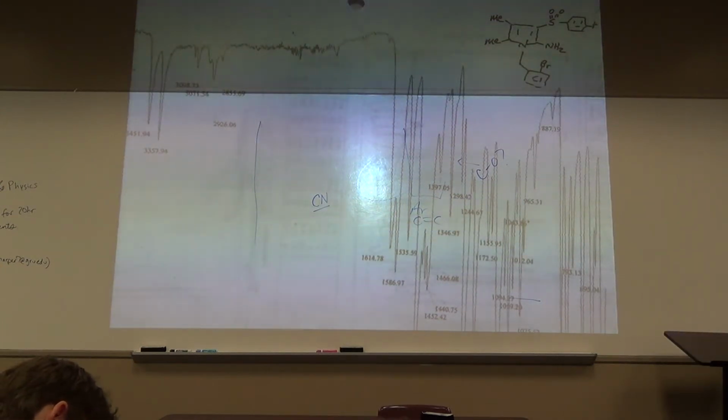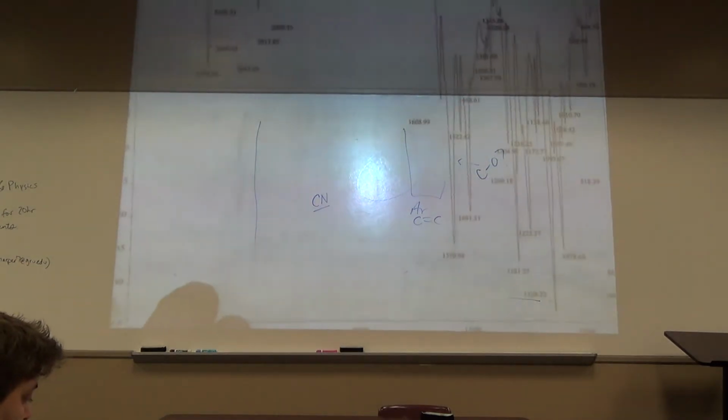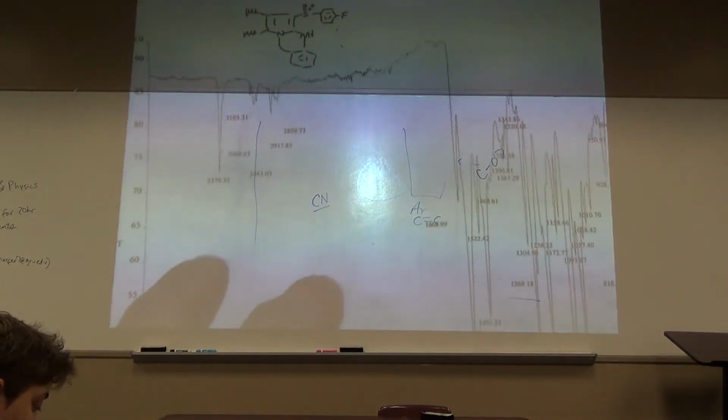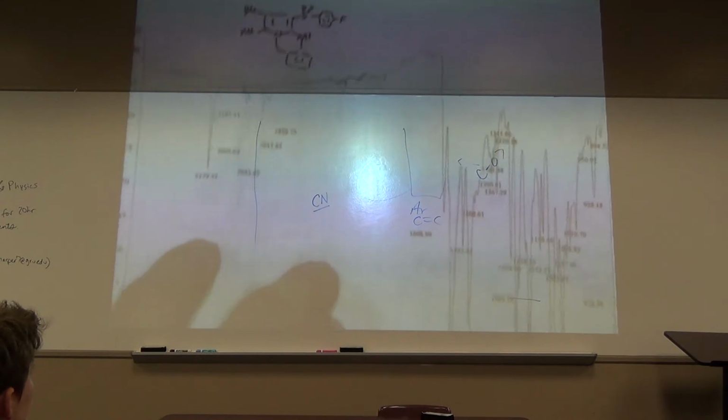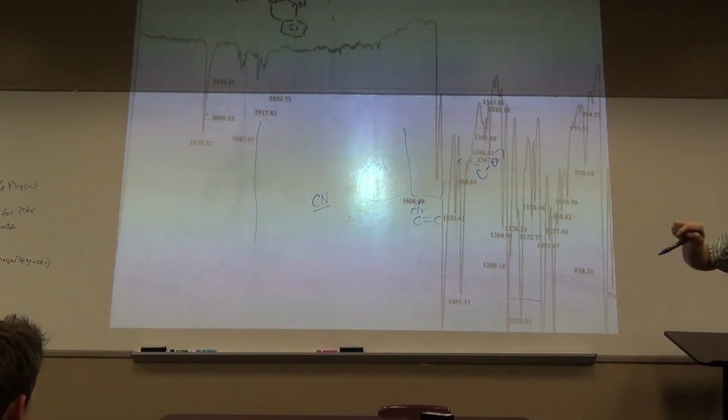When we did the reaction, one of the first things we do when we get a new product is run and get an IR. And when we did the reaction, of course, after doing some research and getting it to work, that's the desired product with the nitrogen now bonded to the ring instead of the bromine. Does this IR look like the product?